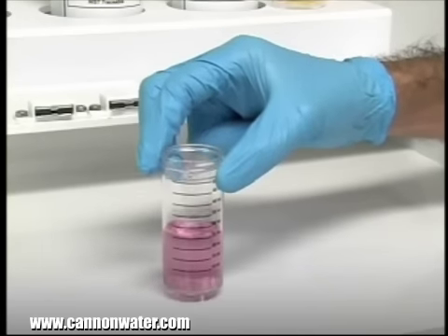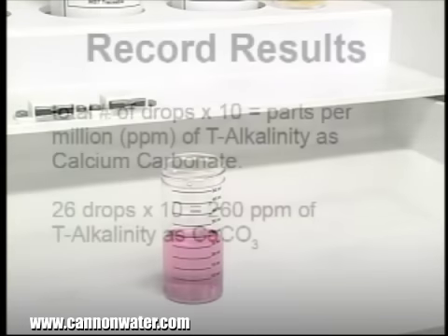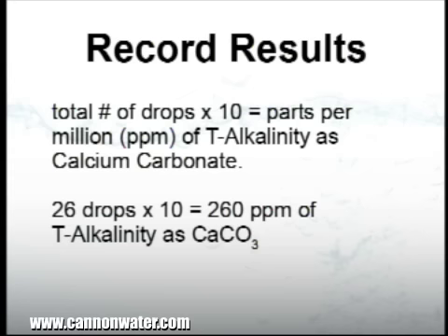According to the endpoint ID procedure, the titration is complete when the sample changes from green to red. In this example, the titration took another 13 drops to reach endpoint. Combined with the 13 drops from the first titration, it has taken a total of 26 drops. Each drop was equivalent to 10 parts per million of alkalinity. Therefore, the sample contains 260 parts per million of total alkalinity as calcium carbonate. This concludes our demonstration of the PNT alkalinity drop count test kit.